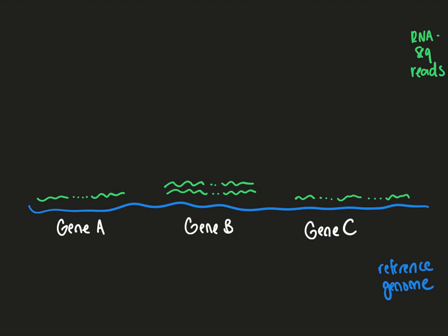We should also remember that because we're looking at RNA, when we're mapping these RNA-seq reads to the genome, we might encounter regions where there are introns in the reference genome, but not in our processed RNA transcript. So, depending on the type of library you prepare, that may or may not have long enough reads that might contain an intron. When you're mapping, the actual result of your mapping might be something like this, where part of your read maps to the reference genome, part of it doesn't. That's putatively an intron, and then the remainder of the read maps to somewhere else along the genome.